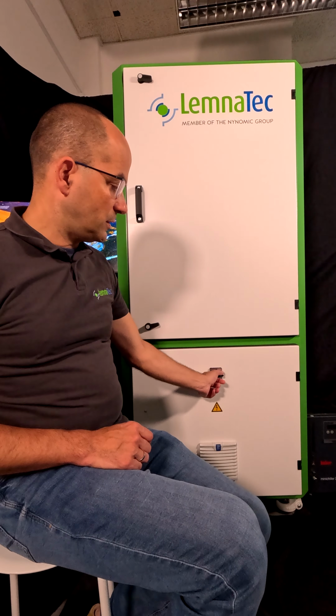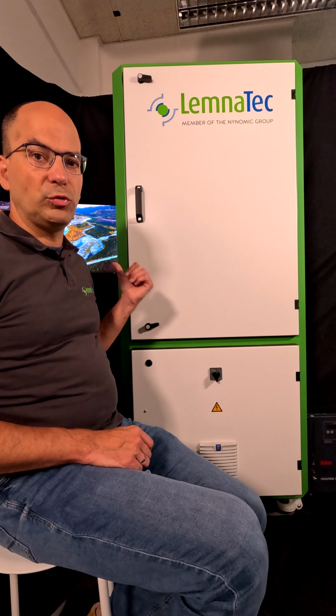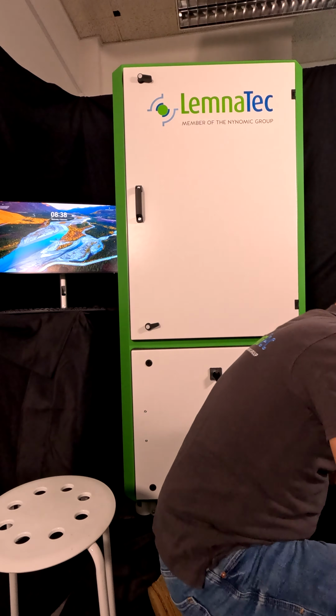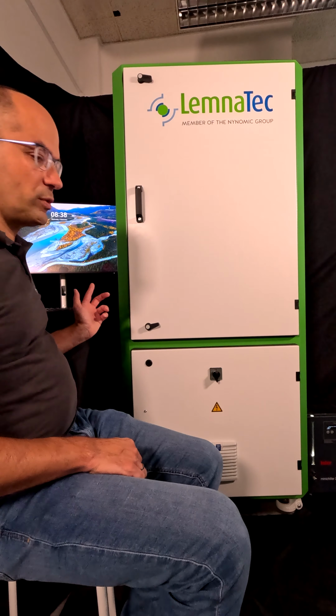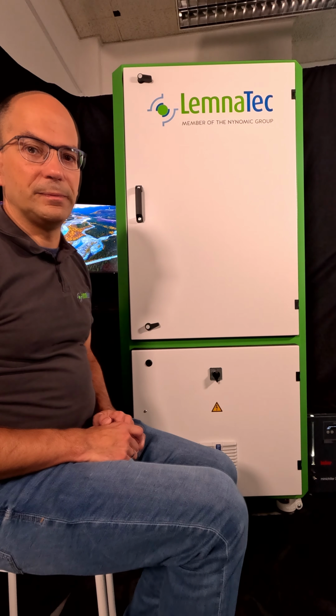For working with the PhenoAIxpert ES, we need to switch on the system as such, have the computer running, and we need to switch on the cooler. When everything is running, we can use the computer workstation to access the functions.